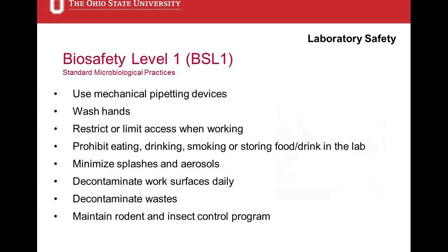Standard microbiological practices at BSL-1. Nothing real crazy here. Use mechanical pipetting devices, no mouth pipetting. Most of the time when I say this to students, they all look at me like, what are you talking about? Who would do that? Every once in a while, when I'm teaching a class that has an older PI, they look at me and they go, what do you mean no mouth pipetting? I still do that. So some people actually do mouth pipette. We do not like that. Obviously, there's a chance that you could suck something up into your mouth. We don't want you to do that. So we want you to use mechanical pipetting devices.